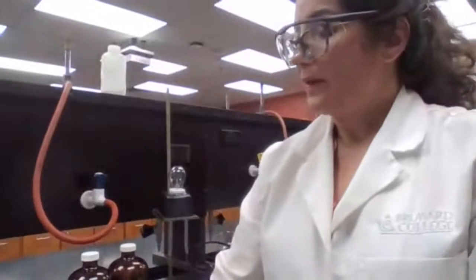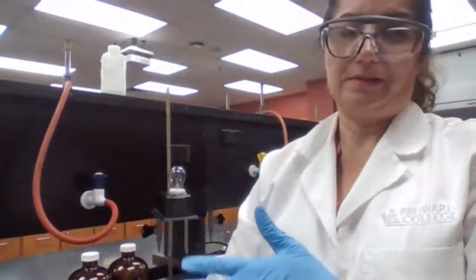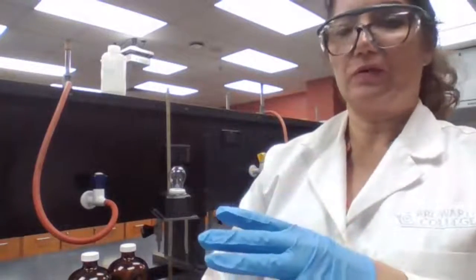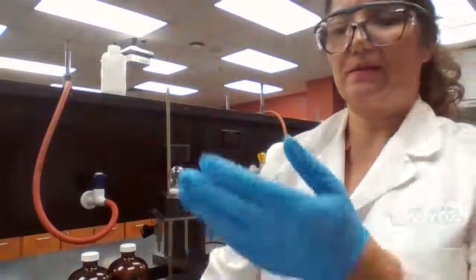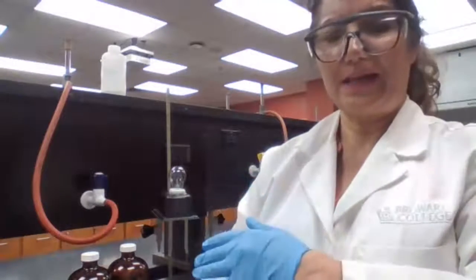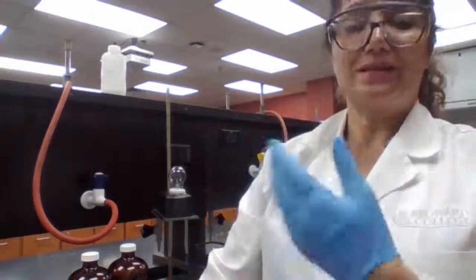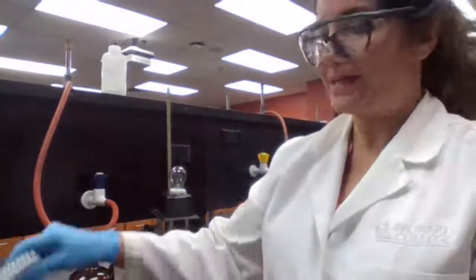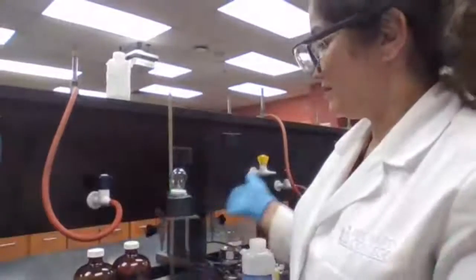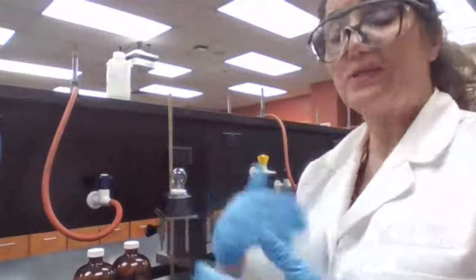So we compare the strong acid with the weak acid. You saw the results for marble with acetic acid, marble with hydrochloric acid, zinc with acetic acid, and zinc with hydrochloric acid. Strong acid, fast reaction. Weak acid, it wasn't a fast reaction. In the same way, a strong acid is a strong electrolyte because it generates lots of ions.